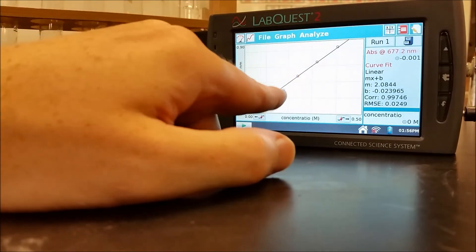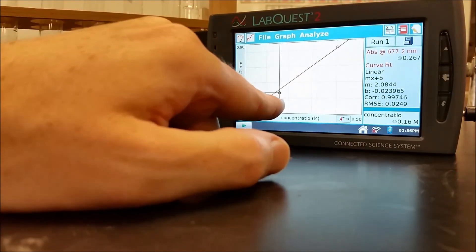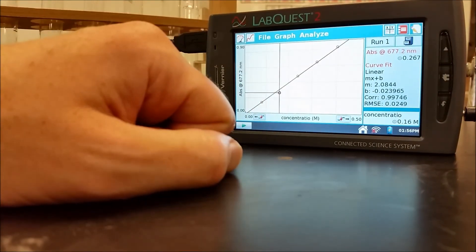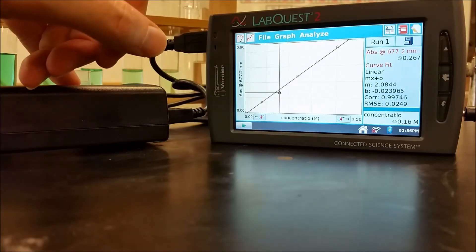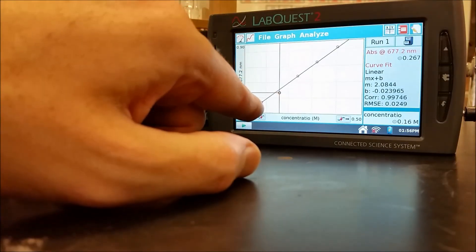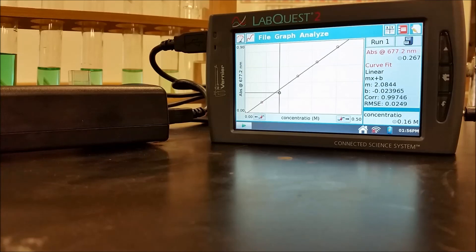The other thing you can do is you can actually go on here and kind of look at where these points are. So this right here has an absorbance of 0.267. If this one is 0.260, it should be a concentration a little bit below that. Although this particular point is off from the line a little bit. So we'd probably be better off using the line in this case to make that judgment.